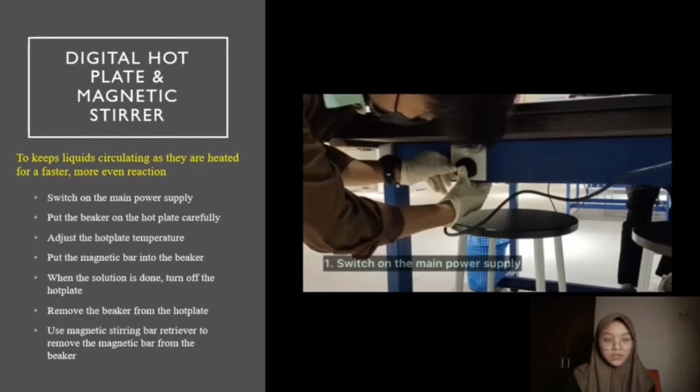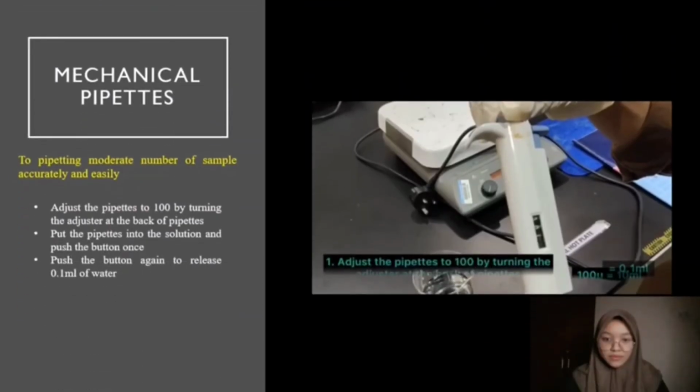That's all for digital hot plate and magnetic stirrer. Let's proceed with the next equipment, which is mechanical pipettes. Mechanical pipettes is used to pipette a moderate number of samples accurately and easily. For the first step, you need to adjust the pipettes to 100 by turning the adjuster at the back of the pipettes. If you wonder what is the adjuster, after this I will show you in the video.